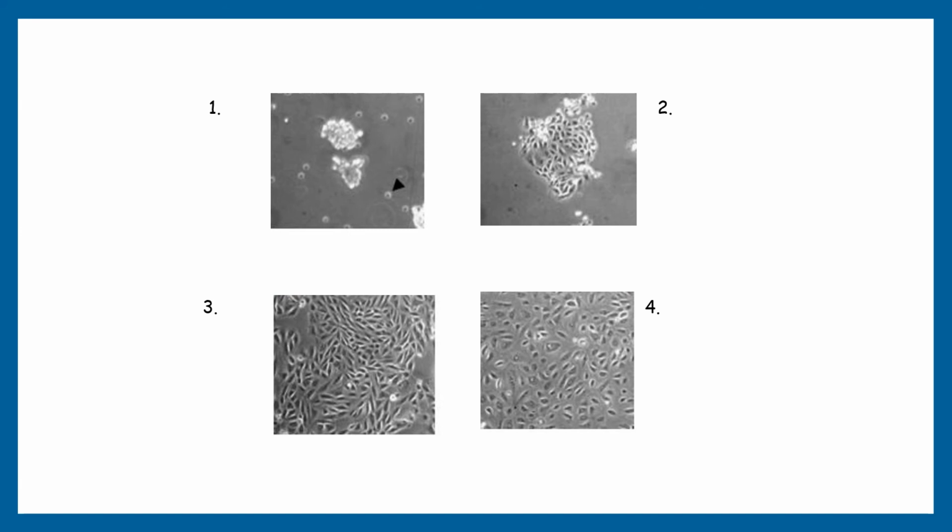These are the real images of ovarian surface epithelial cells, courtesy of course Google Images. In this figure 1, we can see the small clusters of ovarian surface epithelial cells freshly isolated from an ovarian tissue sample. Several erythrocytes are also visible, marked by arrowheads.